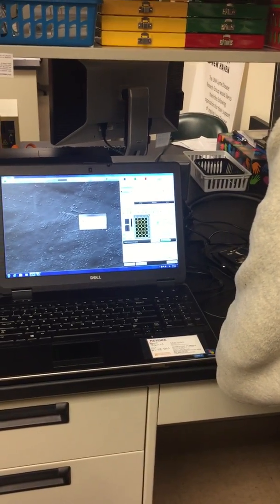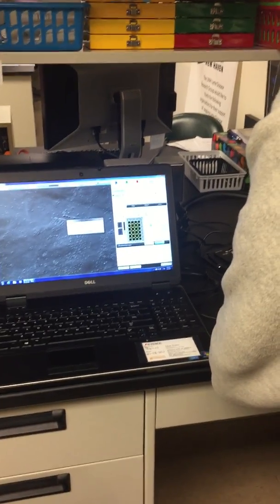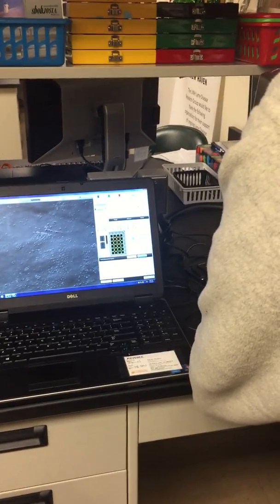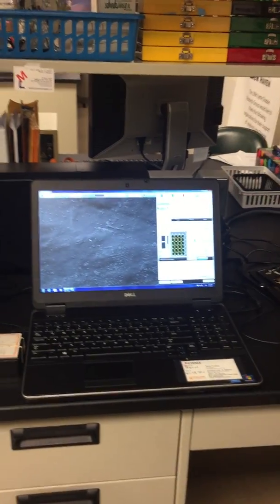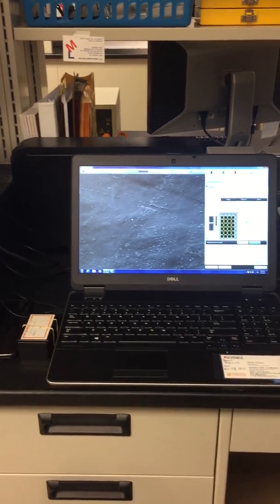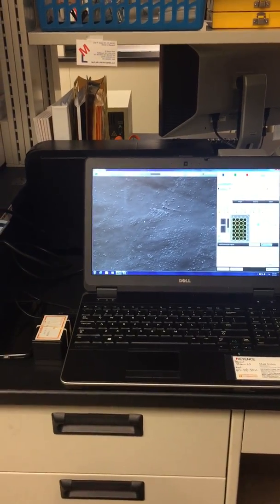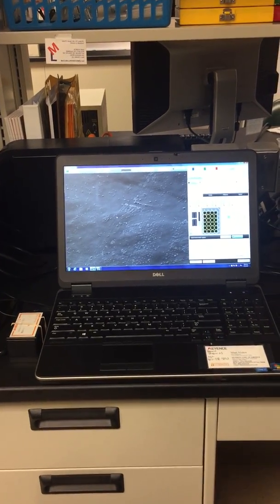And then, are we trying this, or should I just talk it through? So let's see. So just have multi-point selected here. So basically what you're going to want to do is find it. With this, do you set Z ranges usually, or just a single plane? I focus on each wound, but it's going to be a single plane. Okay. I would say usually for wound assays, it never really goes out of focus anyways.